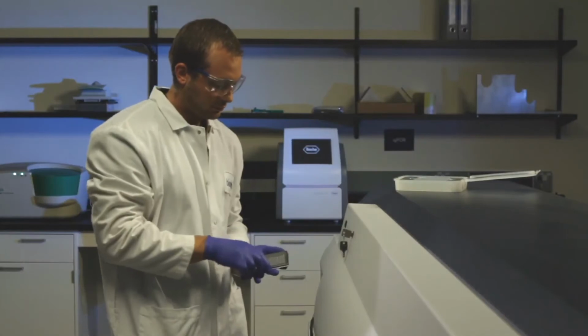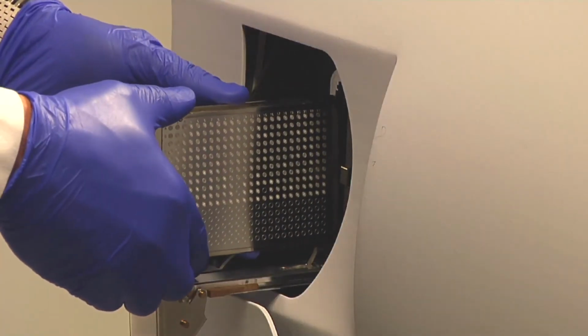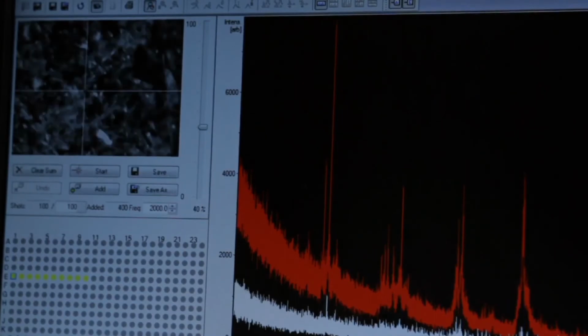We measure hundreds of proteins simultaneously in one run by mass spectrometry. We measure all of the variants, well not all, but many of the variants of those proteins in that same run, and that gives us almost infinite complexity to the spectrum compared to those targeted assays that are based on ELISAs.